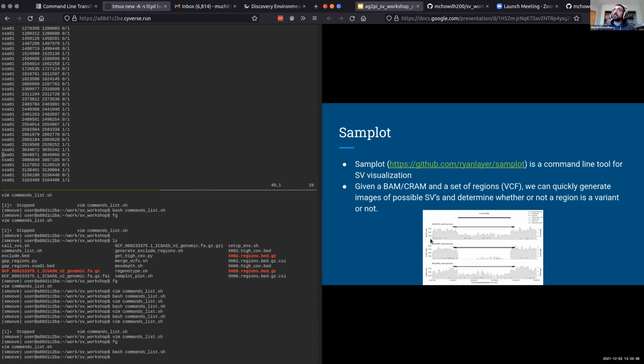But on the left side, you'll see what the insert size is. And so basically, when you see horizontal lines that are aligning with this point in the y-axis, that means that the insert size of these particular paired end reads was 3,000, for example.